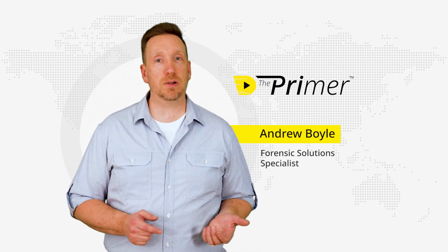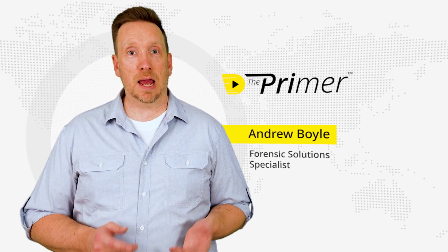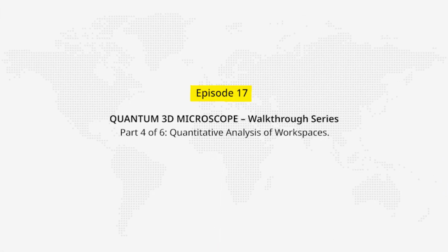This is a video how-to series on the Forensic Technology product line and some tips and tricks on how I think you can best use them to get the most efficient use out of them.